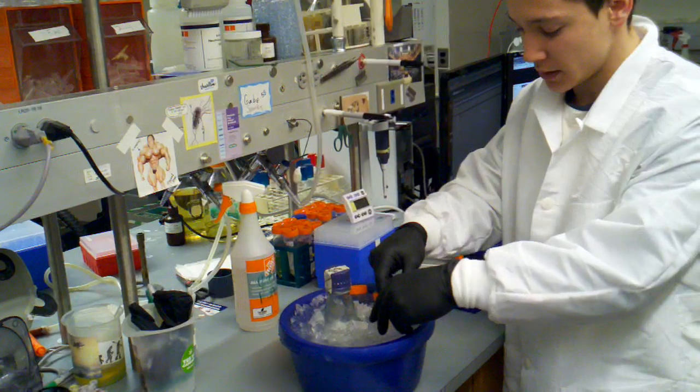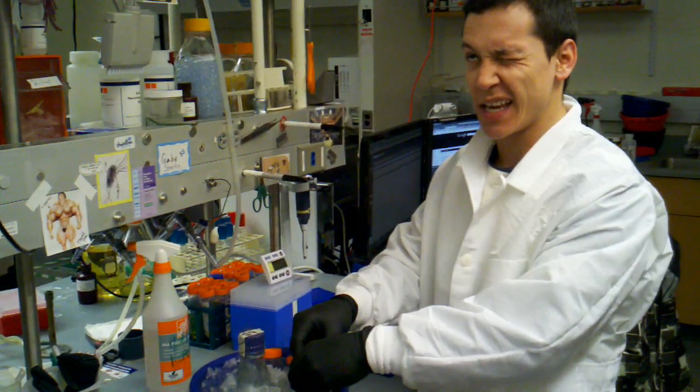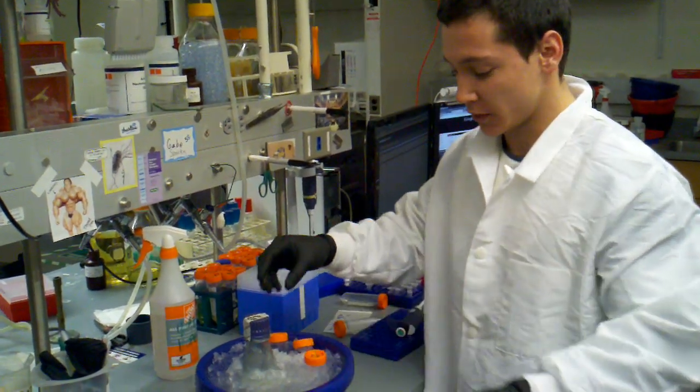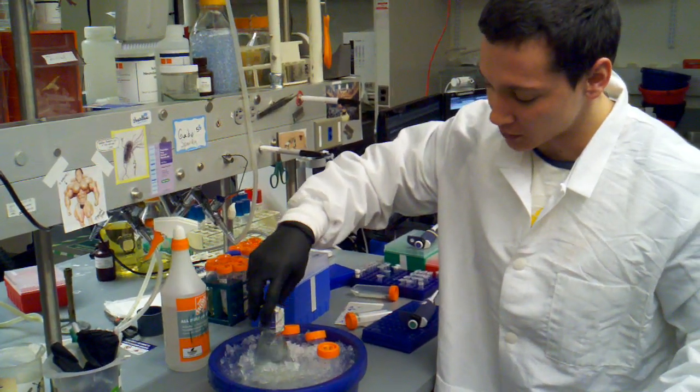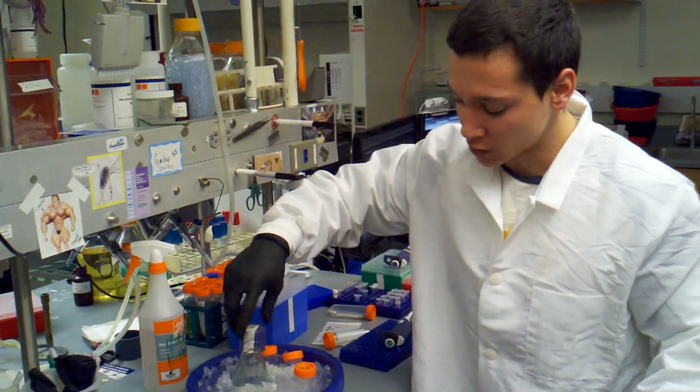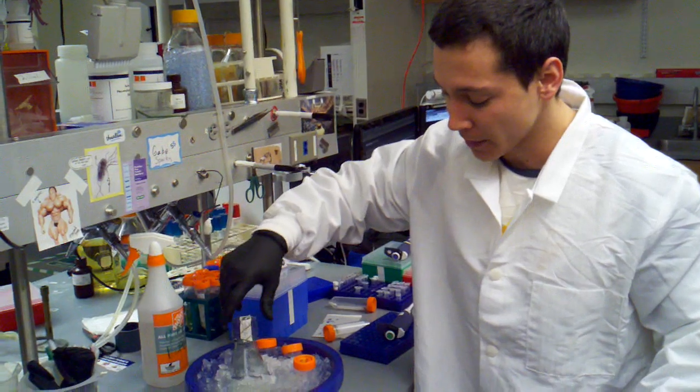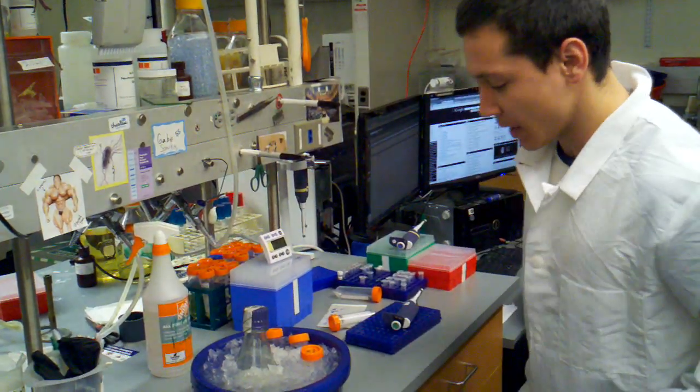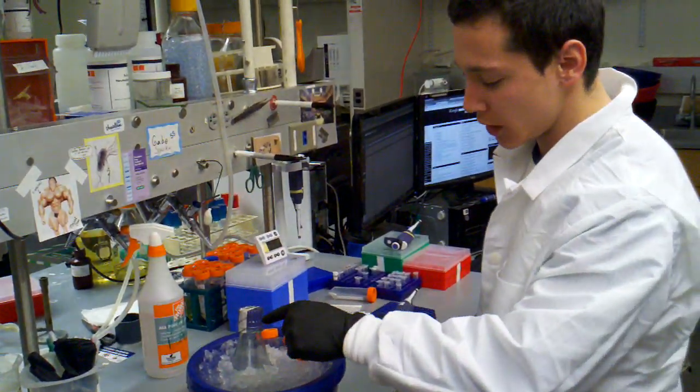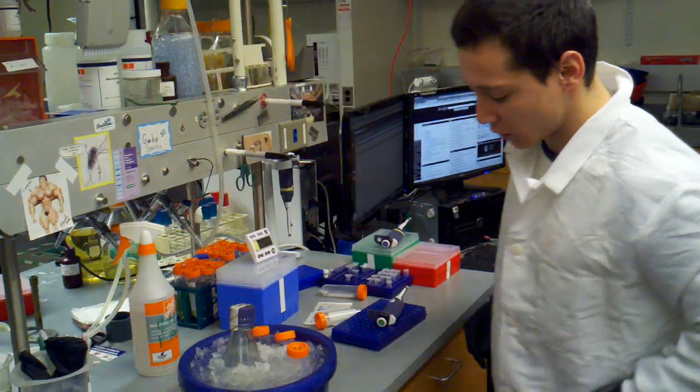And we're going to be using the TA10 rotor for this centrifuge. So this is probably cold enough. I just slosh it around a little bit more. Make sure it's really cold. That's the most important part at this point. And now we're going to transfer the culture from our flask into our conical vial.